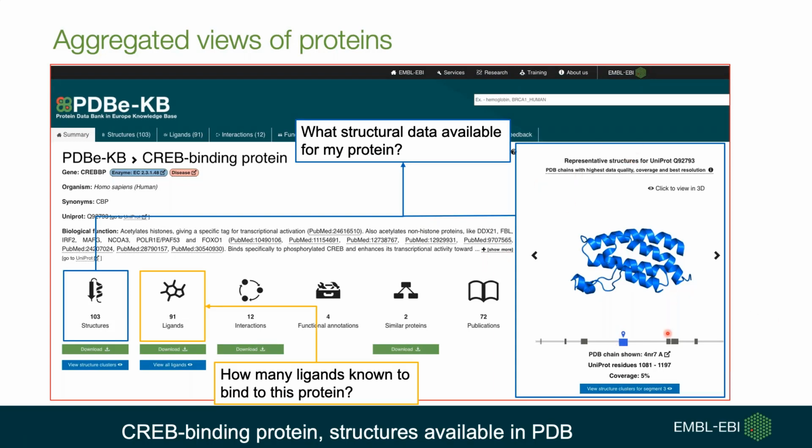There are a few components here like this, which gives you the representative structures, and this is a summary component. So these components give you a higher level of information as in here, and there are also components below, which give you more detailed information. Next, we will see some of these components and the respective API endpoints which are used.